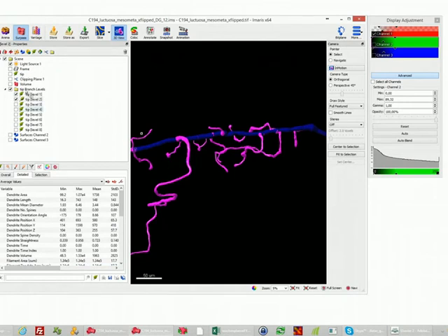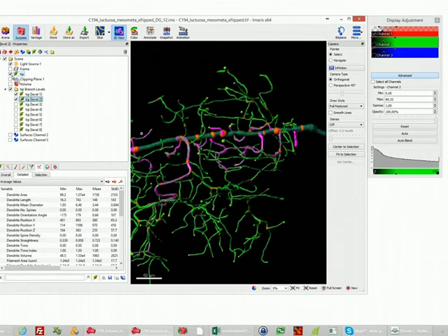Okay, that concludes my very short presentation of Imaris. Of course, there's much more to do in filament tracing, but maybe you can join us for another webinar if you're interested in more details.